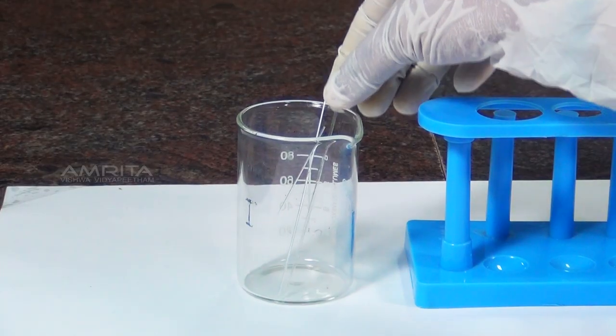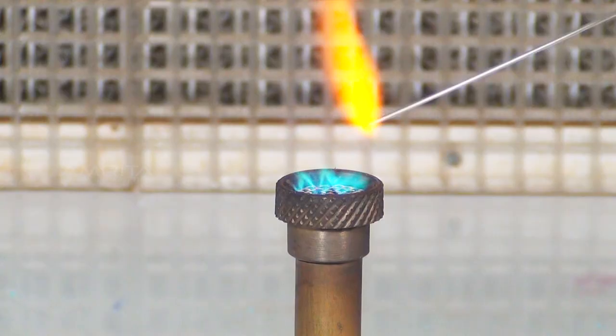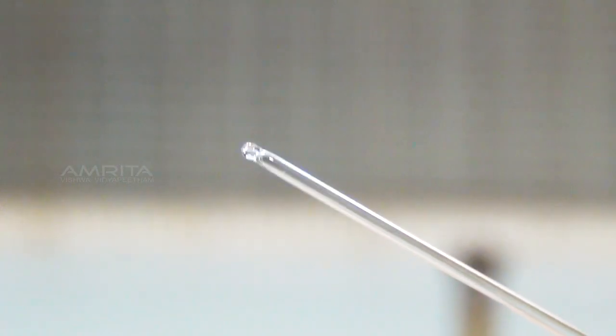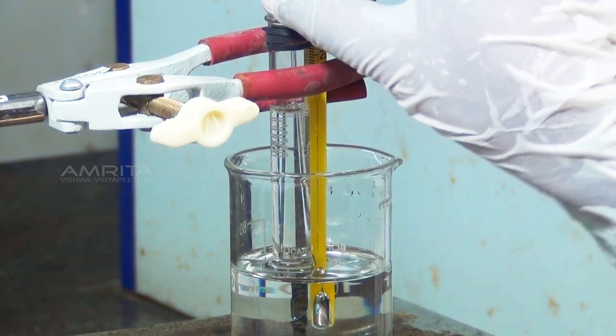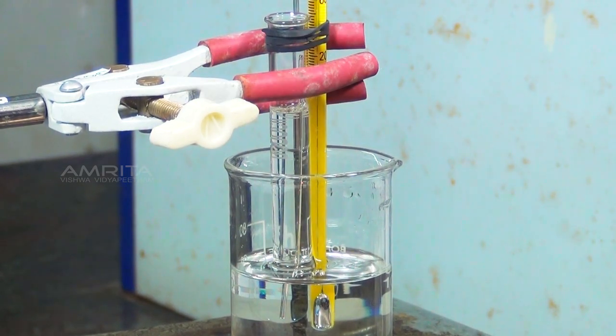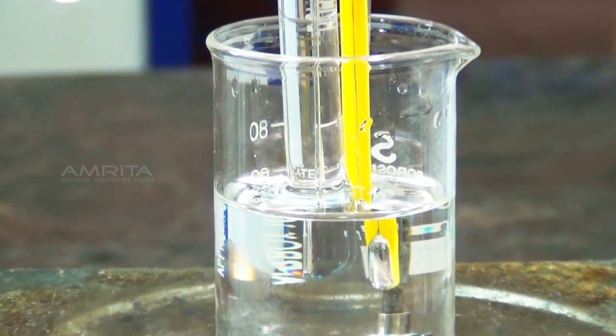Take a capillary tube and seal one end by heating it in the flame of the Bunsen burner. Place the capillary tube in the test tube containing toluene so that its open end is dipped in toluene.